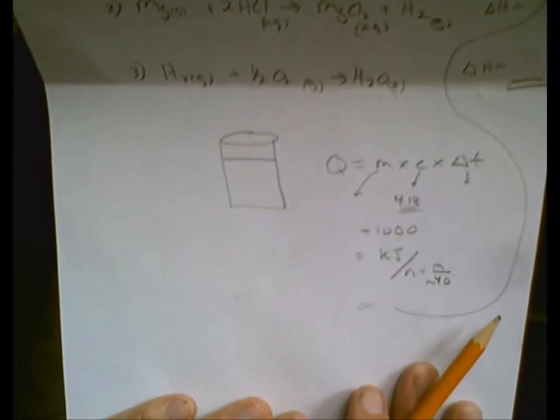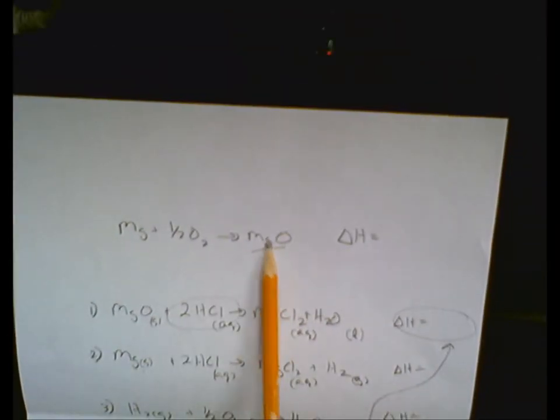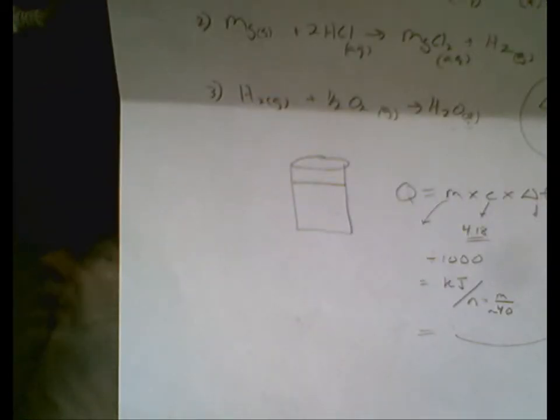You're going to have to do a percent error in here. I did a video on that earlier. So what you're going to have to look up is your known value you should have got for the heat of MgO and see how close your calculations were.